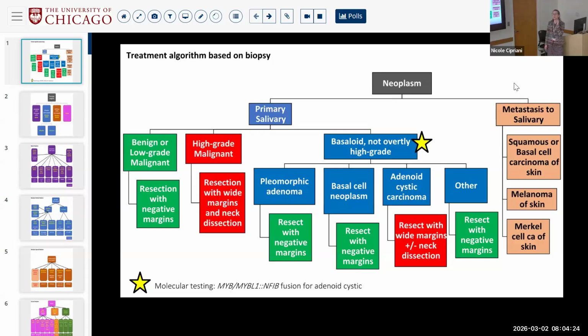While we're here, what anatomic level of the neck is the submandibular gland? Level 1, right? So when you see a level 1 neck dissection, know that that will generally include the submandibular gland. If it's a benign, non-neoplastic submandibular gland, you can select 1 or 2 representative sections.